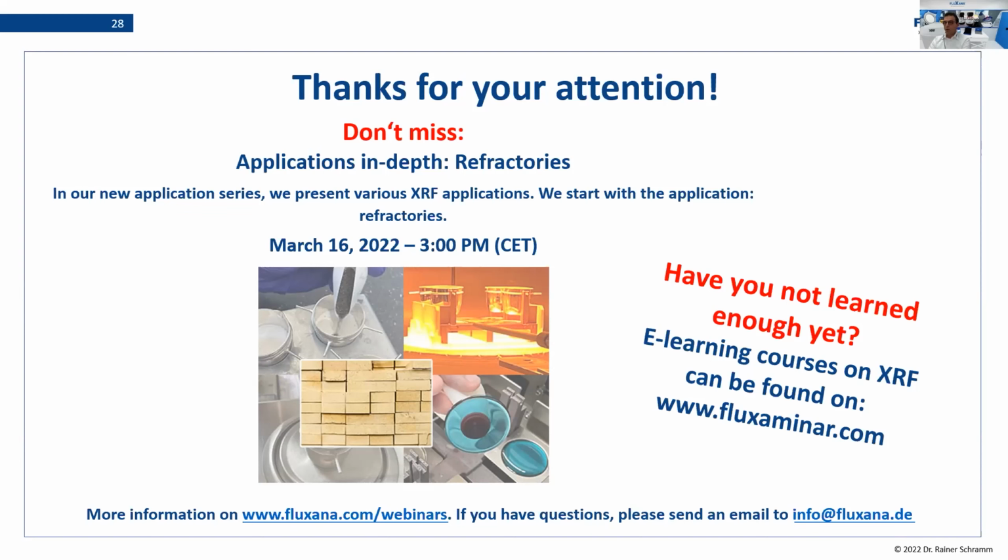In this way, if the XRF instrument has drifted away, we can factorize and eliminate this long-term uncertainty. But it is a risk, and we always have to watch it carefully to be sure that this long-term uncertainty doesn't play a role in our test.